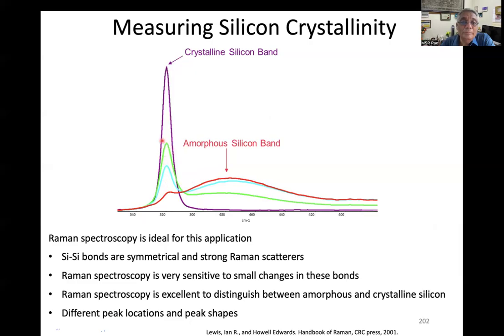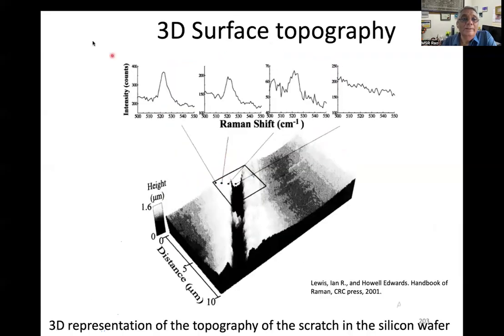From the broadening and the intensity, we can assess the quality of the crystals. Of course, one thing that is necessary is also to do X-ray diffraction to make comparisons between what you get in Raman spectroscopy study and crystallography.